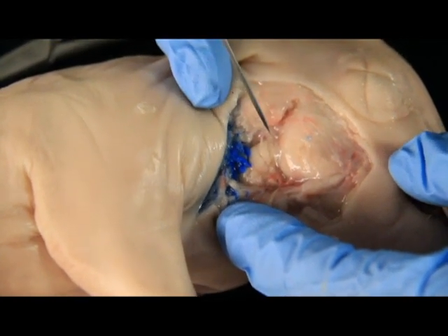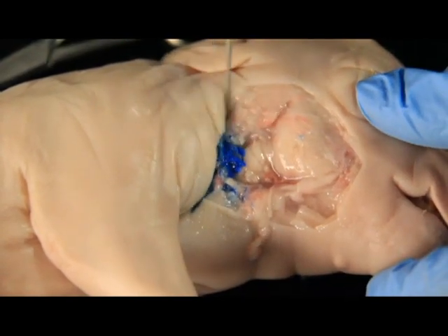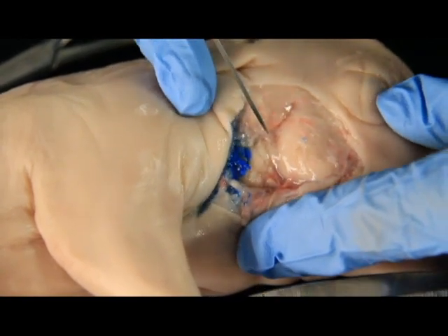So it's important to note that most glands are either going to look like fatty tissue, like this parotid gland, or they're going to look like tiny little beans, like this mandibular gland.